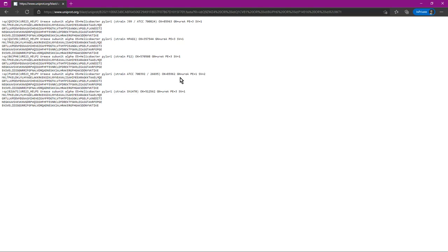Now that you have downloaded the FASTA file with the sequences, we will compare them to each other by performing a multiple sequence alignment. A multiple sequence alignment is an alignment of 3 or more biological protein or nucleic acid sequences. Usually, these sequences are of similar length, and from the output, evolutionary relationships can be inferred. Go to the European Bioinformatics Institute's Clustal Omega program.